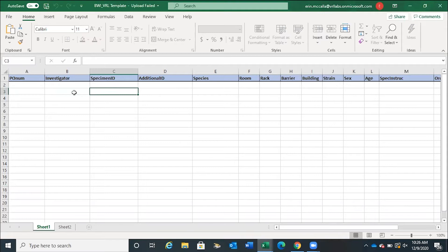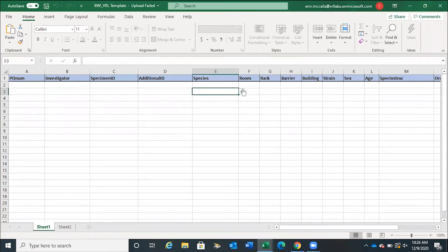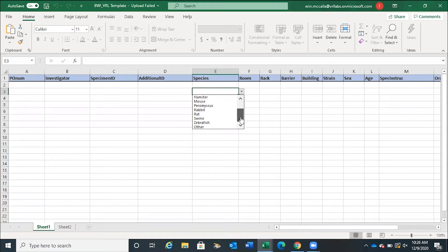When filling out a template, investigator, specimen ID, species, and order code are required. All the other fields are up to the user's discretion. Most fields have a 50 character limit. Species is a drop-down menu. On the small animal template, you have several options — you can type these in by hand, or you can select from the list. Either way, you must use one of the species on this list.